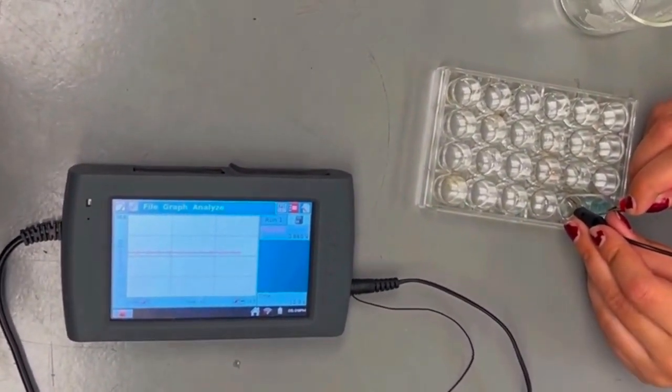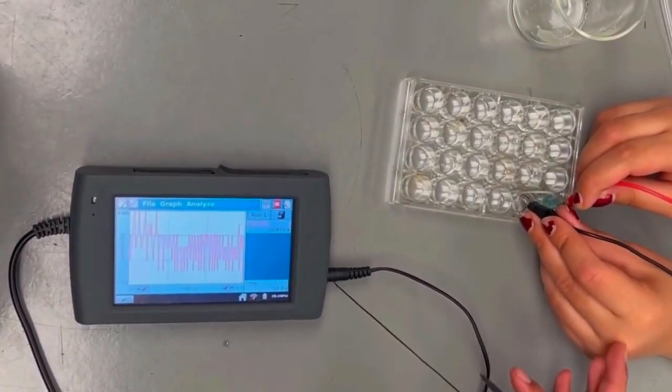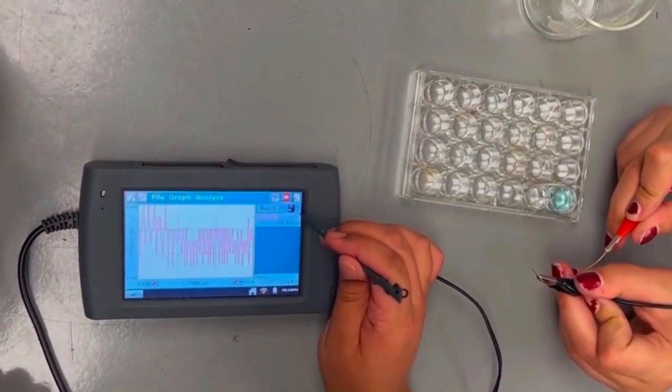The data collection stretches over 15 seconds. Once the trial ends, remove the electrodes from the solution and polish them again.